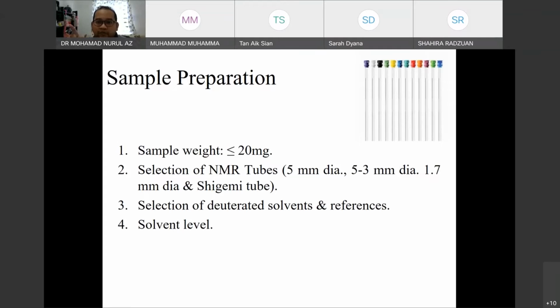If we try to proceed with the experiments without knowing the solvent, the experiment will fail before they can lock the solvent, and the machine light changes from green to red, and they will stop all the experiments all day long. Can you imagine if the experiment that you submitted on Friday at 6 p.m. suddenly fails and the rest of the experiments during the weekend do not proceed.